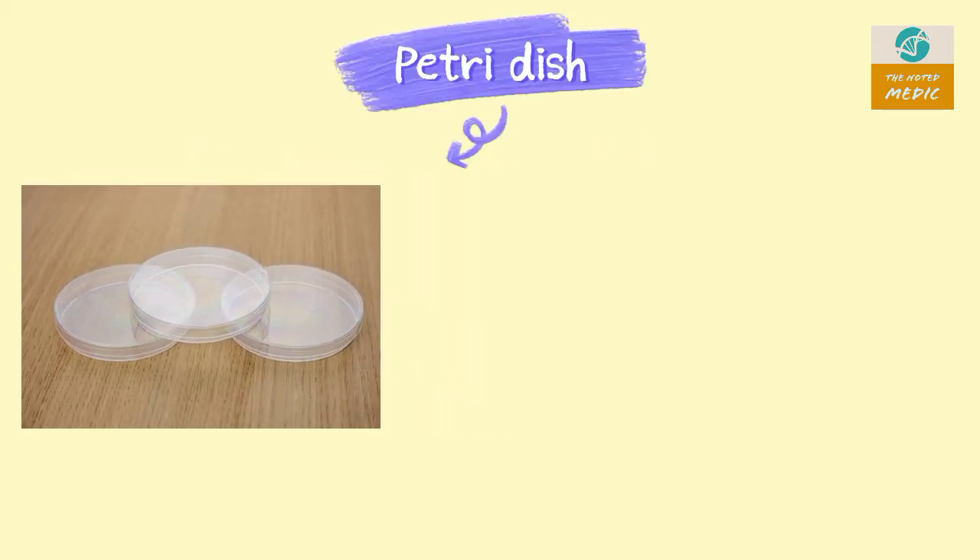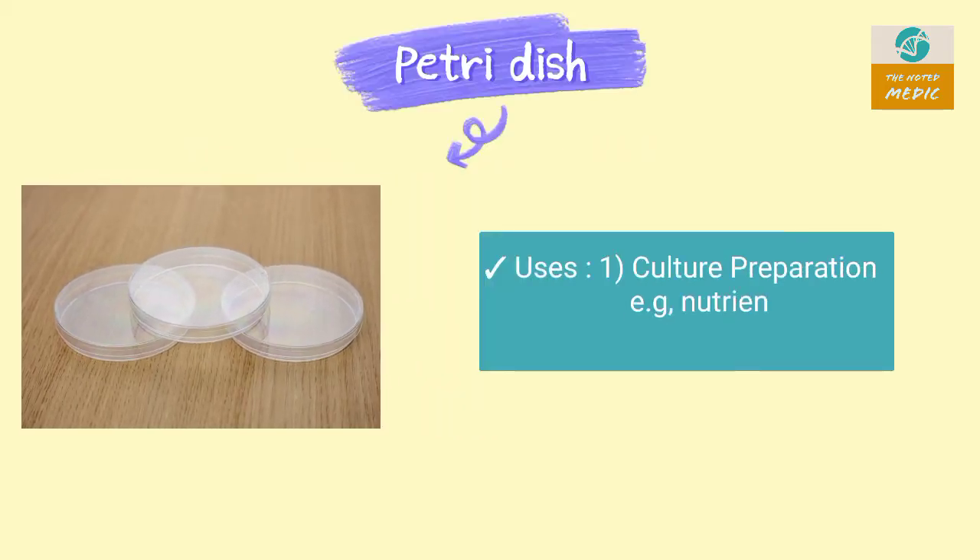This is a Petri dish. It is used in culture preparation and also used in the disk diffusion test.